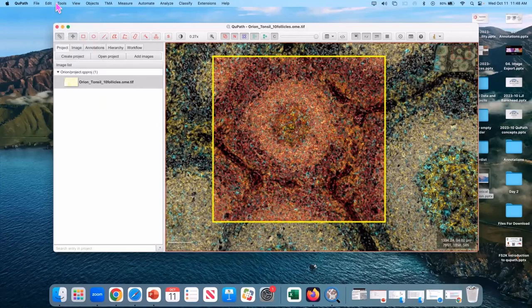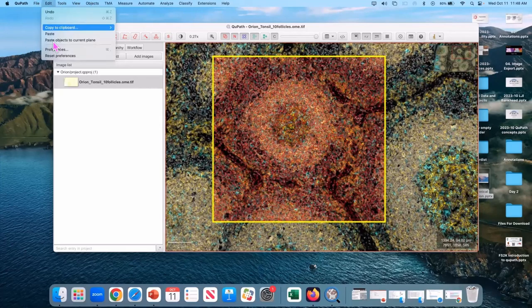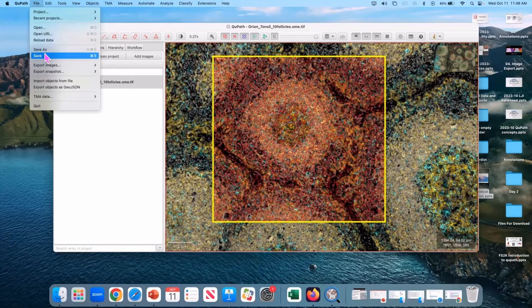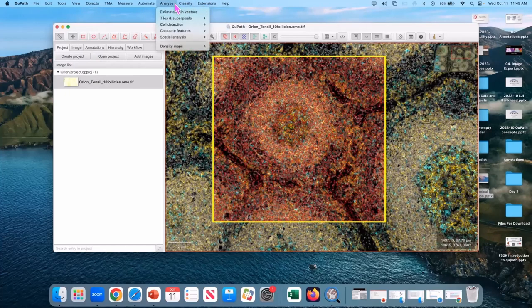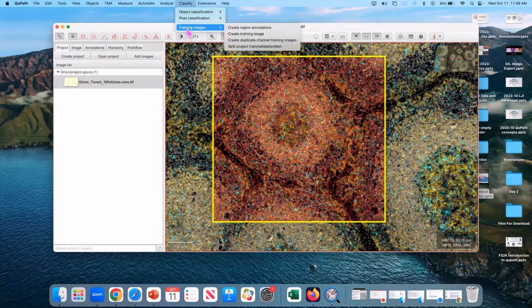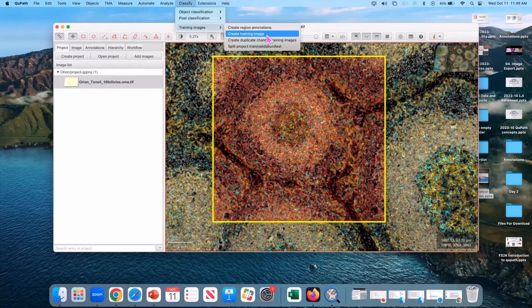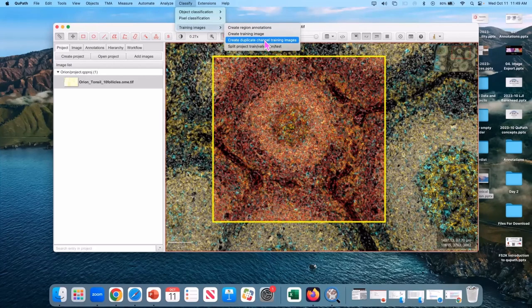So if you've recently remade your cells, make a point of saving your data. You have to save it now. And then we're going to go to classify, training images, create duplicate channel training images.